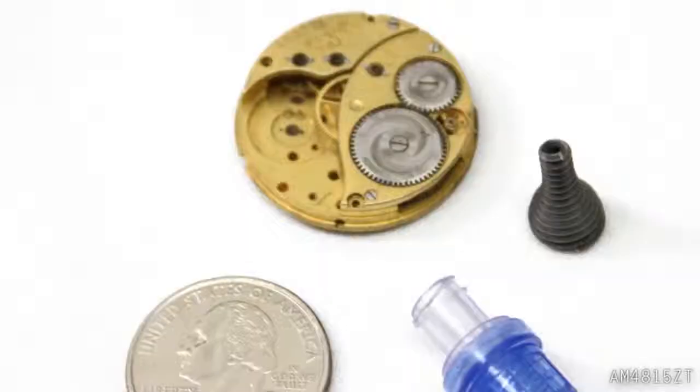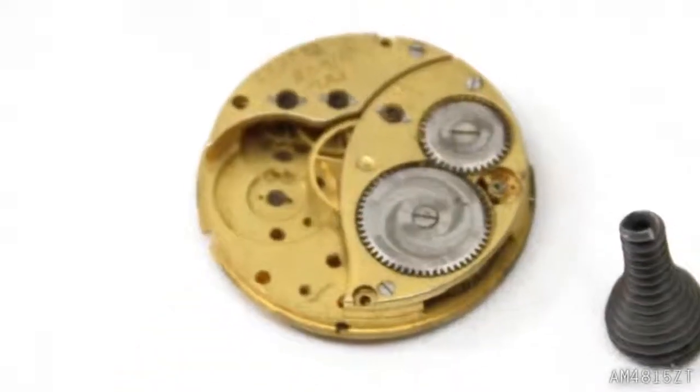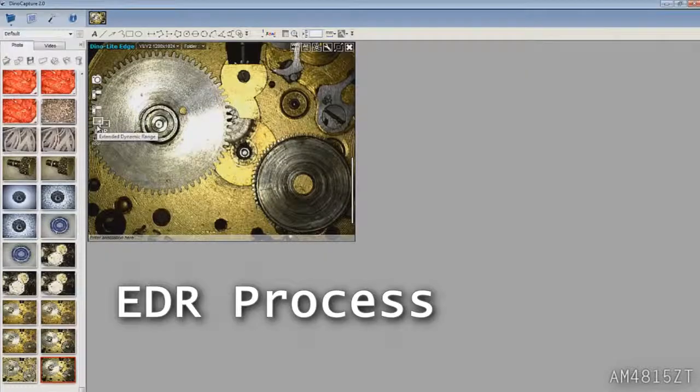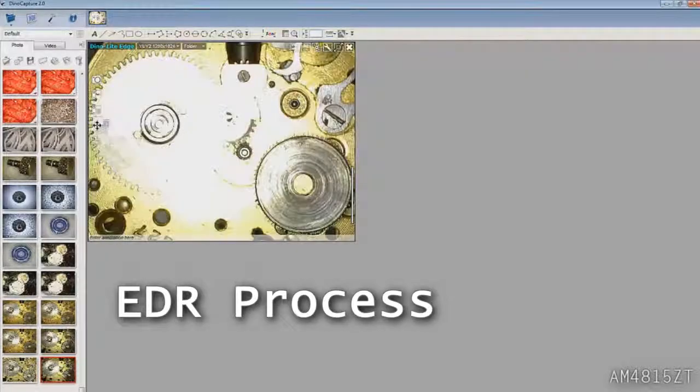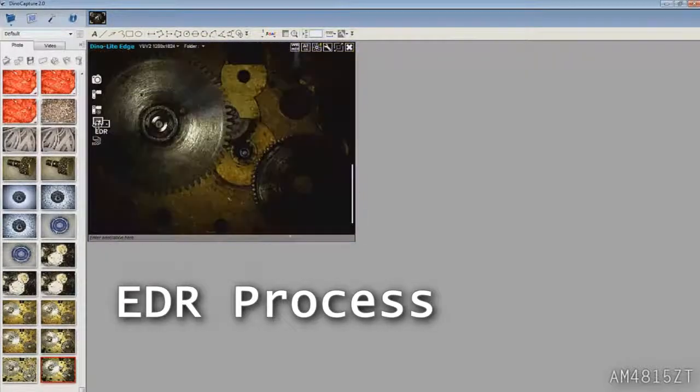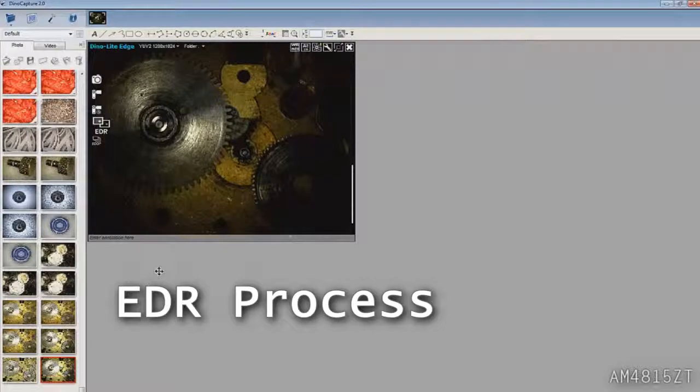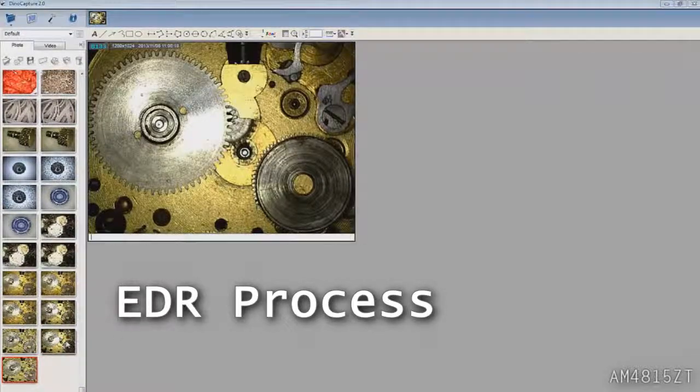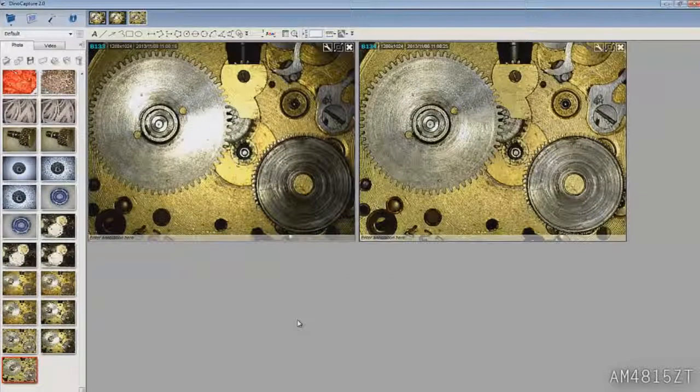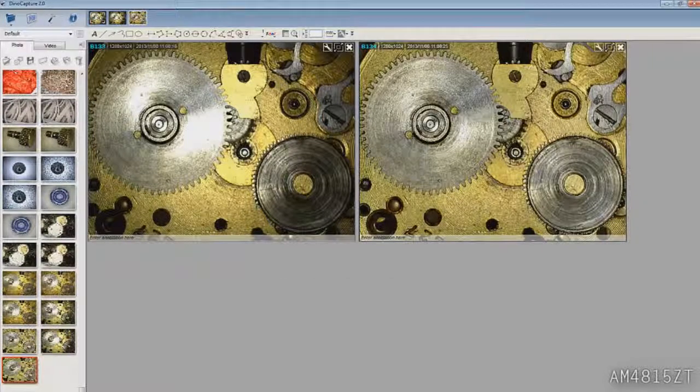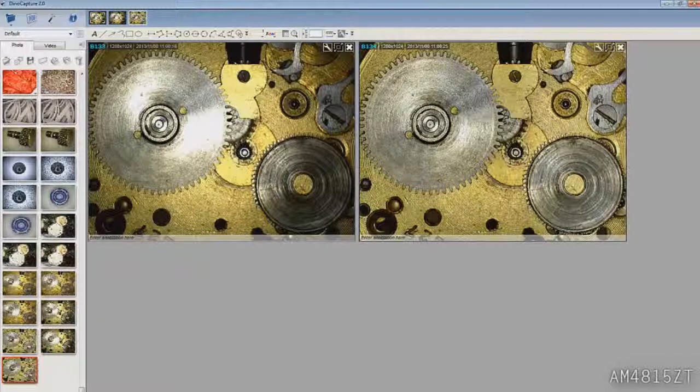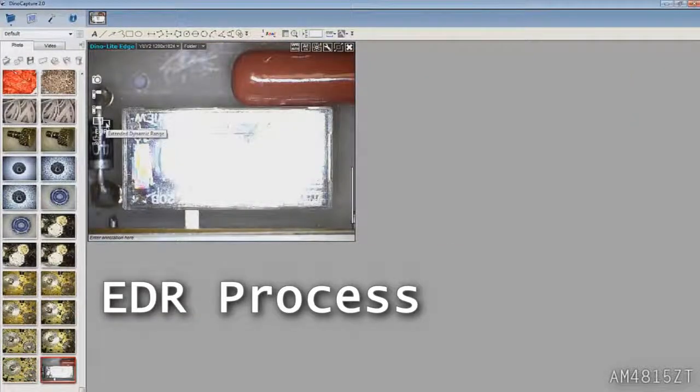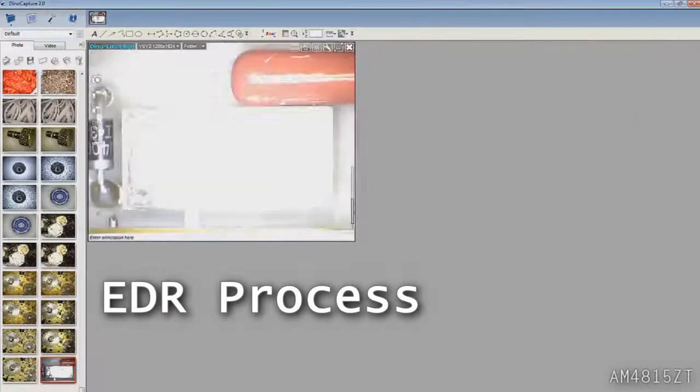Extended Dynamic Range or EDR can help to reveal the details of overly dark or bright areas by automatically stacking images at different exposure levels. This will work well for high contrast or reflective surfaces. To use EDR, simply click on the button.